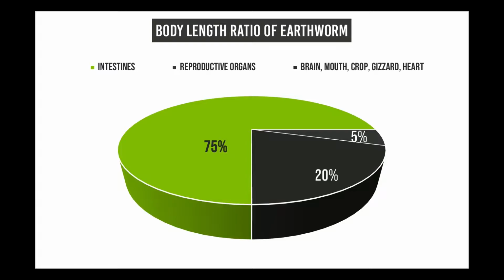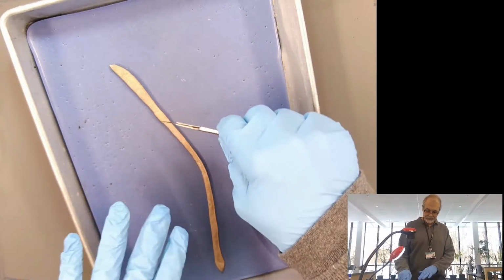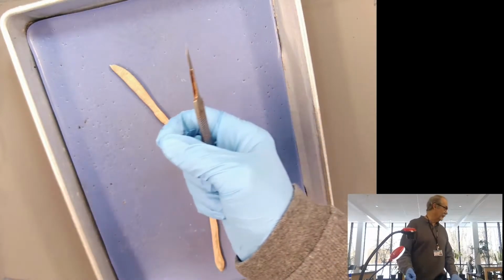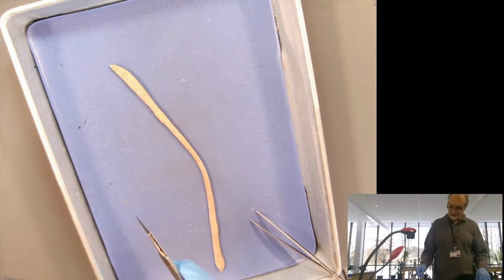Now, what typically we do is that we try to cut just below the clitellum, and then either using a scalpel or scissors, cut it all the way to the top, kind of splay it open like that, and pin it. And we can find some pins in here in a minute, and then we can see what that looks like.